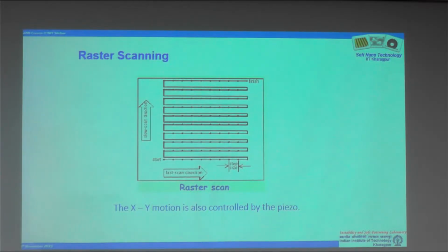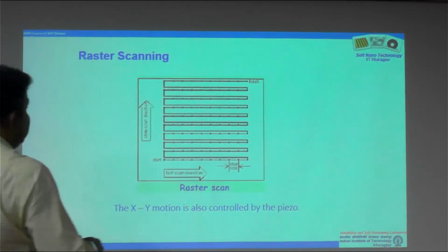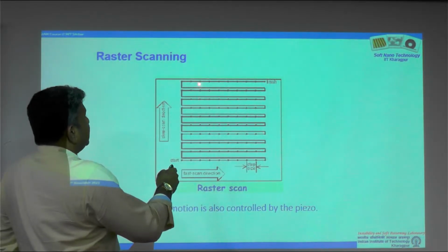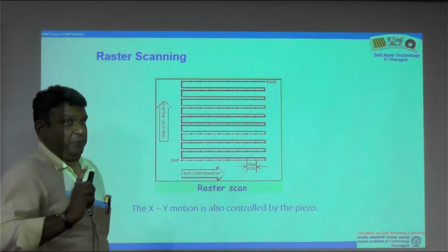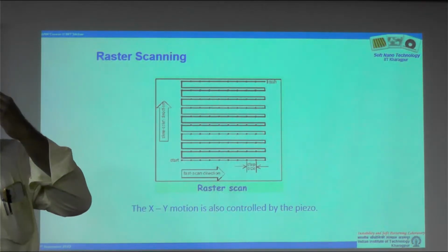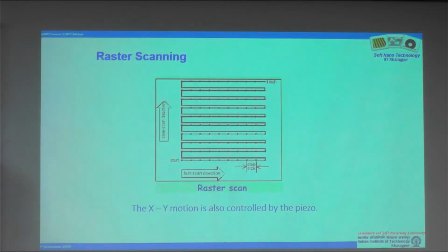Now, the last thing, we are going to focus our attention on the tip as it moves from one point to the next point. That is where all the crux is, exactly the way we talked about the scanning tunneling microscope.